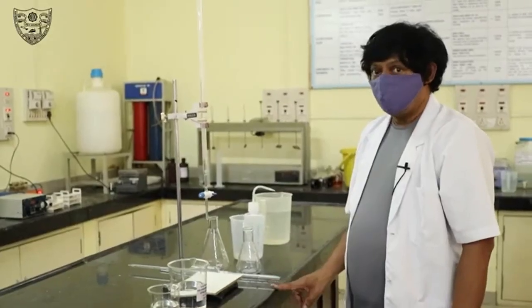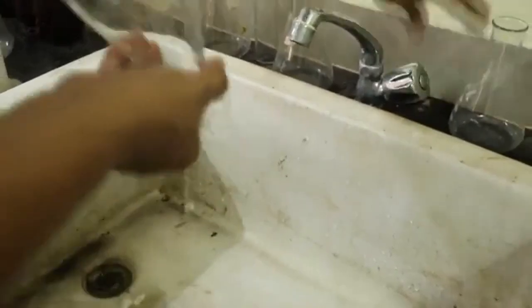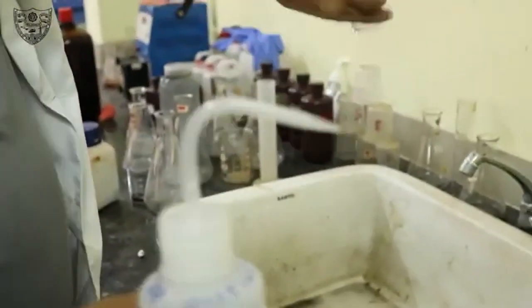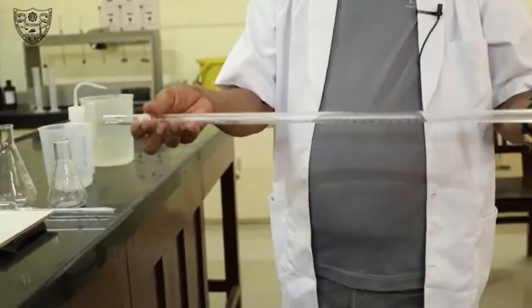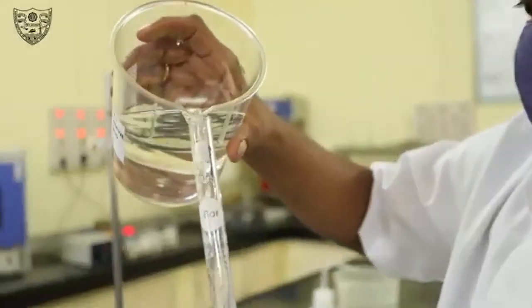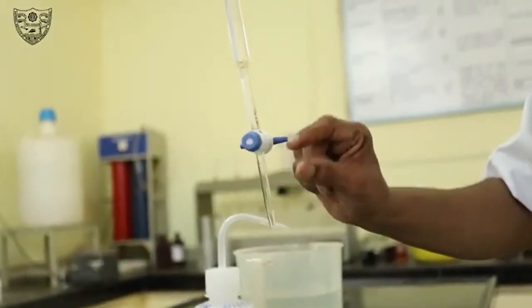This is the experimental setup. Before starting the experiment, wash all the glasswares thoroughly with tap water, then rinse with distilled water. Rinse the burette with standard 0.01 molar EDTA solution. Then fill it up to more than 0 mark. Allow the solution to drain till the air gap in the burette tip is filled. Adjust the burette reading to 0.